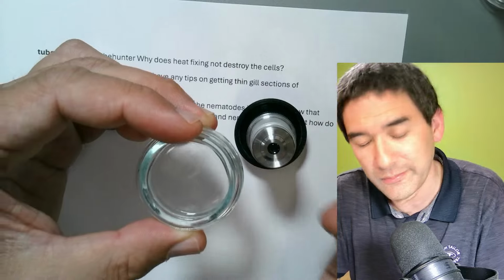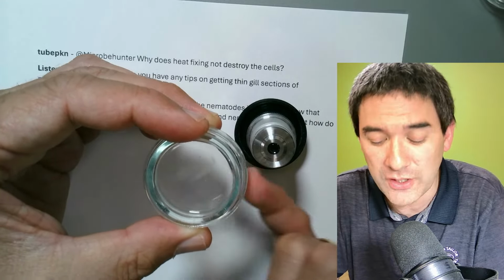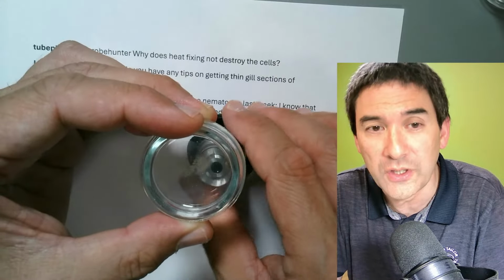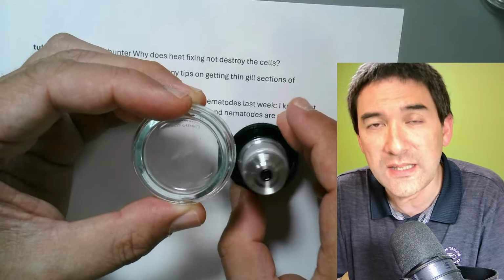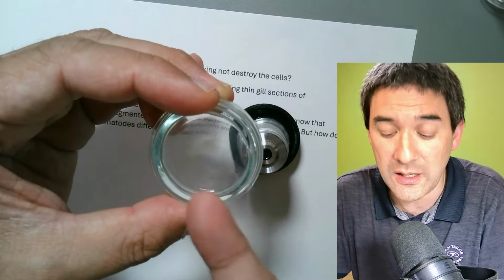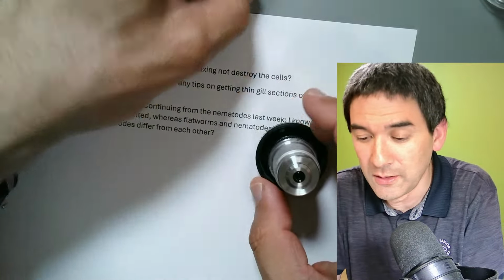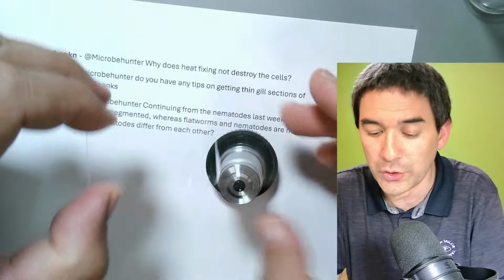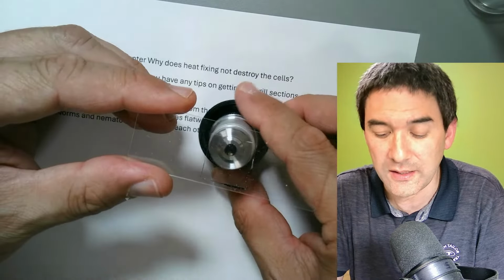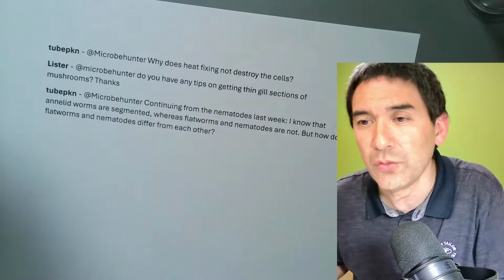Oh, of course, I get it. You see the thickness of the glass or the plastic of the Petri dish and so on, and the working distance. So you're using different objectives with a larger working distance. But essentially, I've not tried this, but I see no problems if, instead of using a Petri dish, why not use a slide? Then you'll probably also be observing the specimen through the glass slide itself. So I see no reason why it shouldn't work.